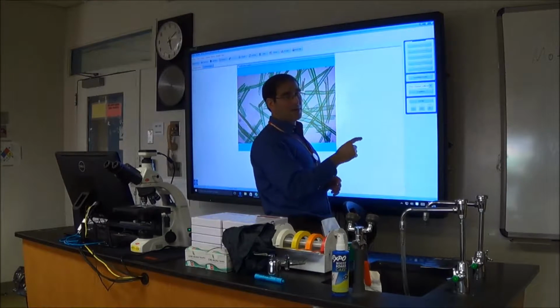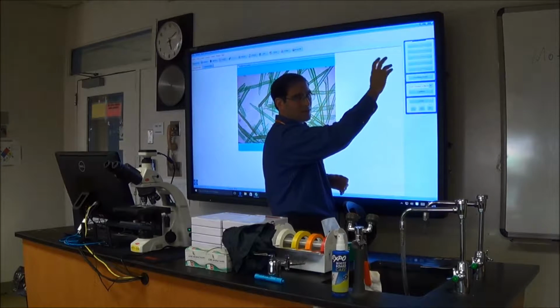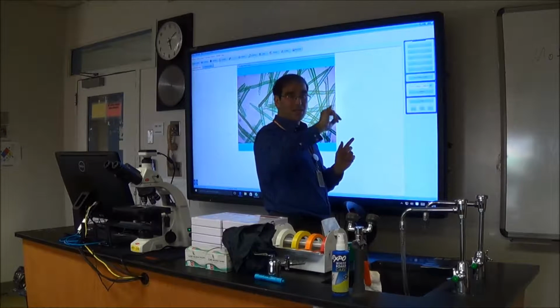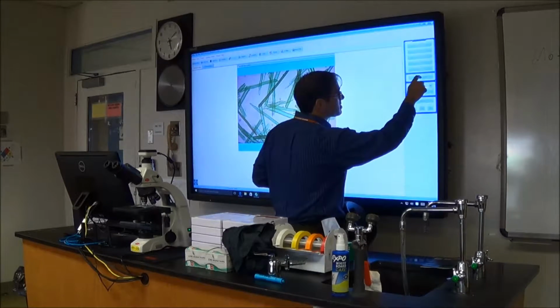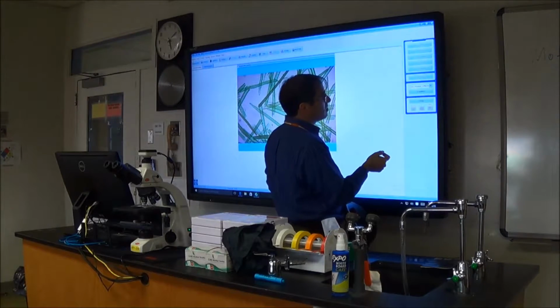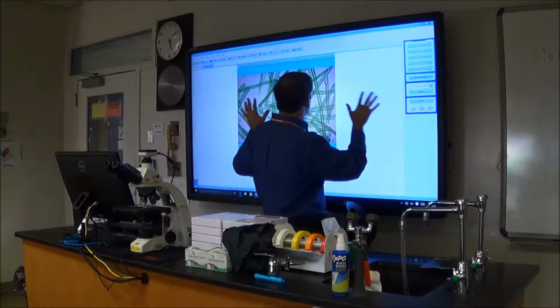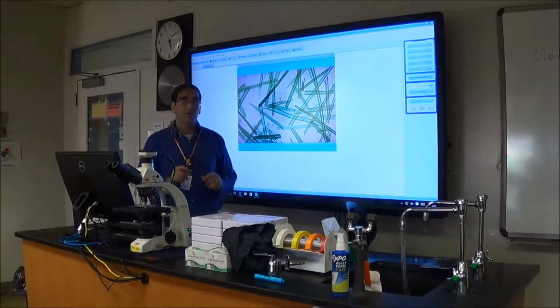When you tap on this, it'll actually show you a countdown from about 3, then 2, then 1 in the box. When it's done counting down, it sends this information out to all the connected microscopes. So watch, I'm going to press Teaching Demo. It's going to go 3, 2, 1. So now, whatever I've got on this screen is on all the microscopes there.